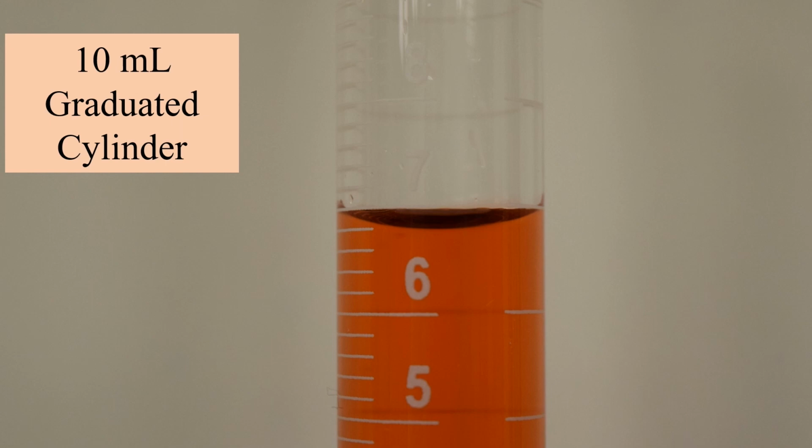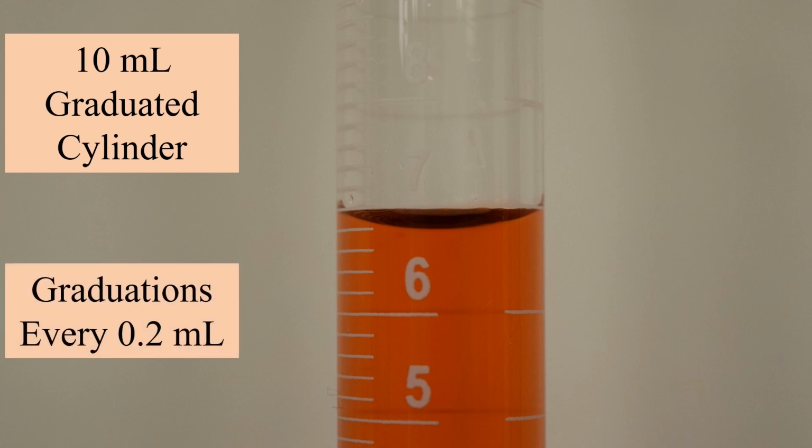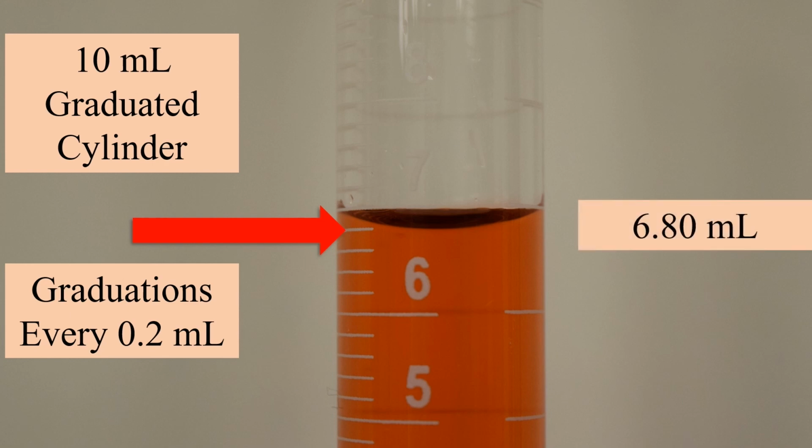Finally, the 10 milliliter graduated cylinder is the smallest in our lab. Notice every major graduation is 1 milliliter. And there are other graduations at every 0.2 milliliters. There are other cylinders that can even read every 0.1 milliliters too. The meniscus here is more evident. We can safely estimate a volume of 6.80 milliliters.